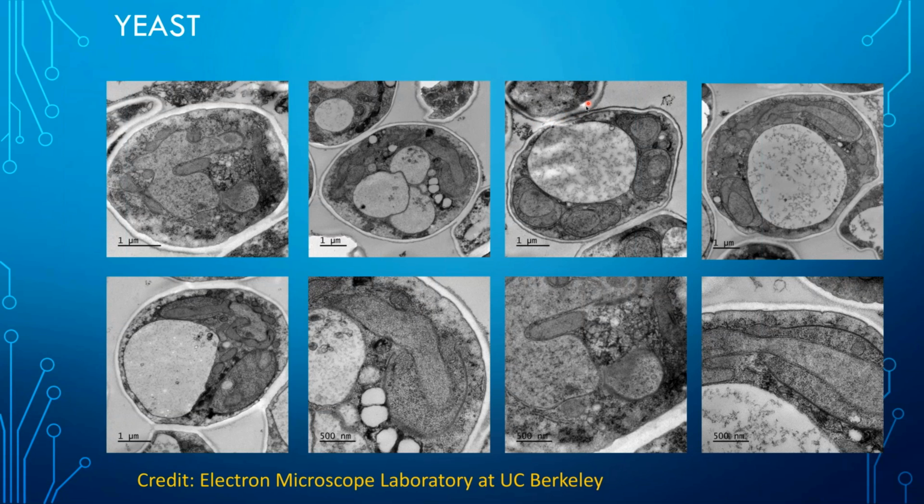You've got very bright parts of the section versus very dark parts of the section. The CMOS is really great because you can integrate the different images together to make a really nice acquisition for your data collection downstream. It compensates really quickly for disparities in the intensity across the image.